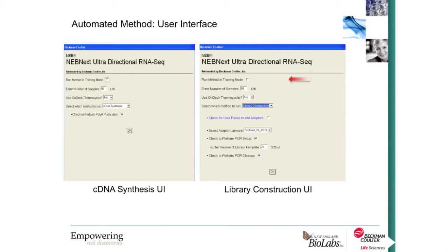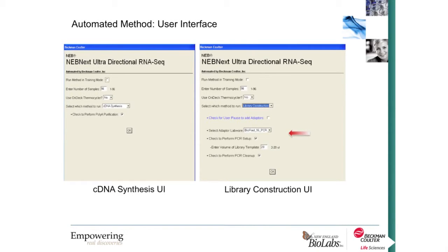The library construction UI also has a training mode option, a number-of-samples input, and the option of on-deck or off-deck thermocycling. Additional options include a user pause to add the adapter plate to the deck, the option to deploy adapters in custom-designed labware — in this case a BioRad hard-shell 96-well plate — whether or not to perform PCR setup, how much volume of pre-enriched library to use as template, and whether or not to perform PCR cleanup. It's a very intuitive user interface that makes operation of this method quite simple.